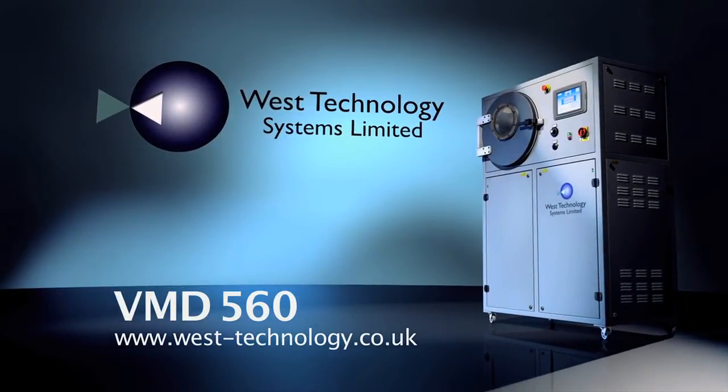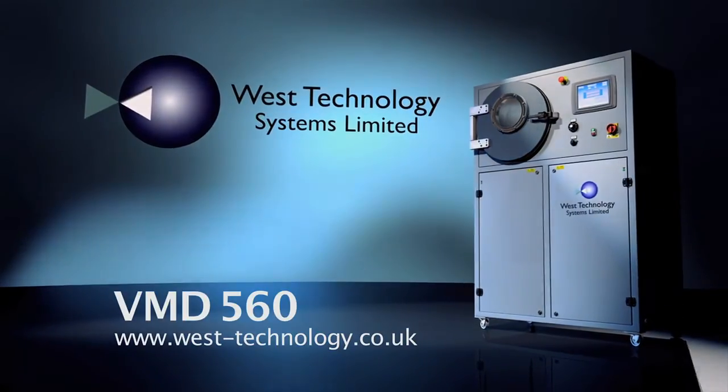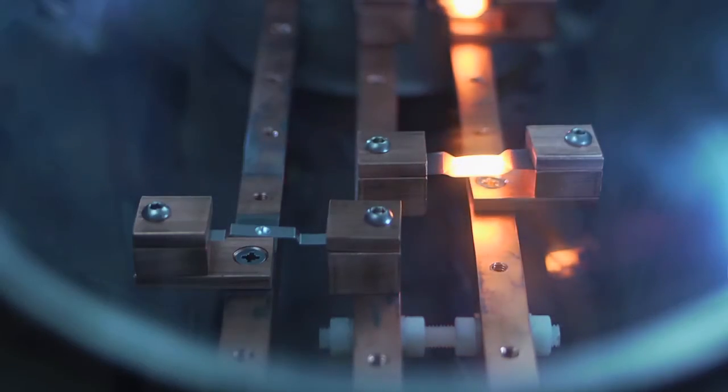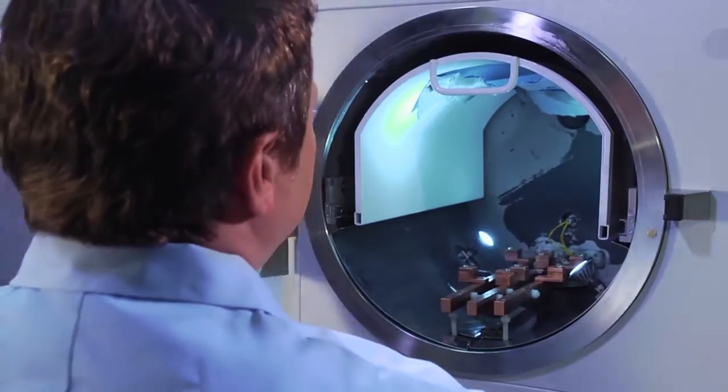The WEST Technology VMD560 is a unique and exciting development using the vacuum metal deposition method. There's nothing else like it on the market. Vacuum metal deposition, or VMD, is a powerful fingerprint detection method which has been shown to develop 15% more latent prints than the superglue followed by dye method, and it doesn't affect any DNA present.